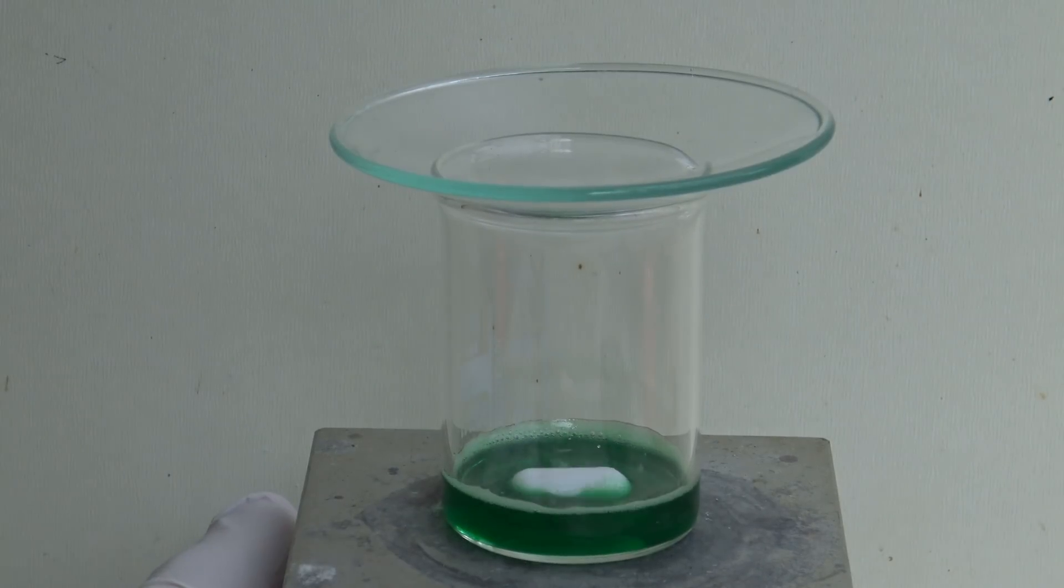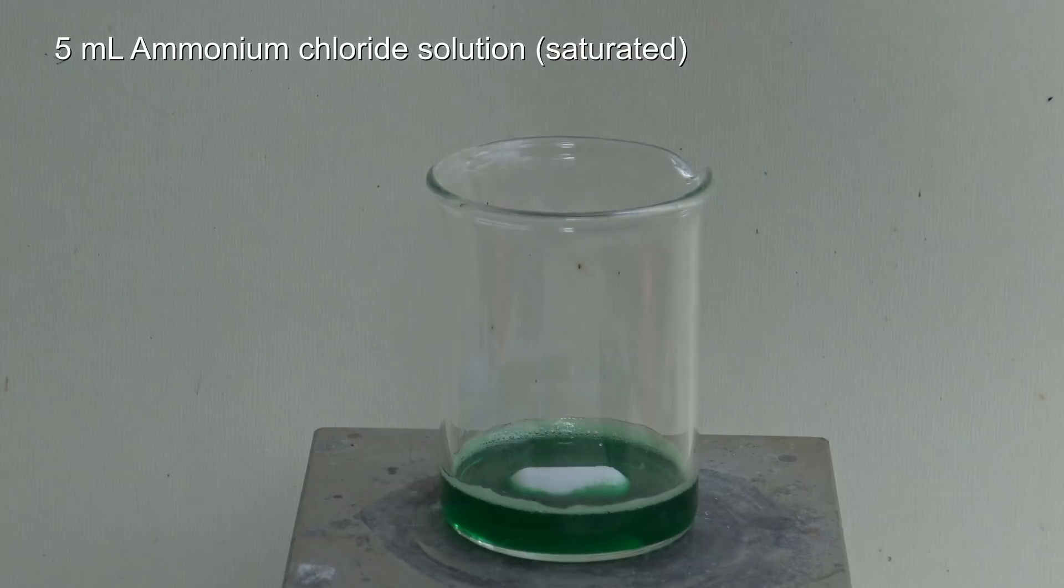When the nickel chloride had dissolved, 5 milliliters of the saturated ammonium chloride solution were added.